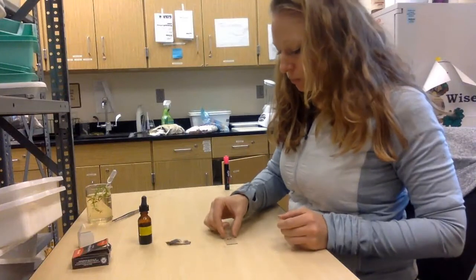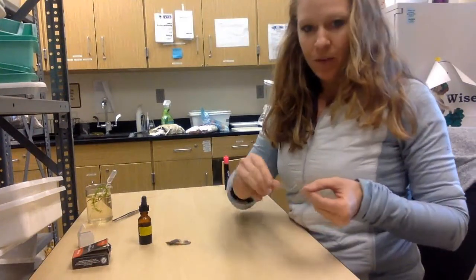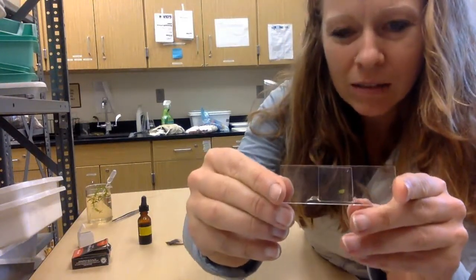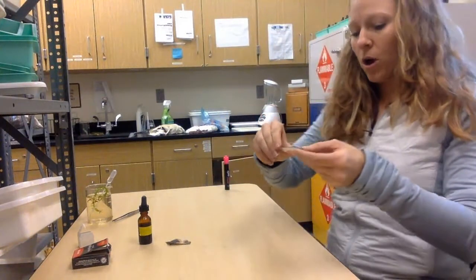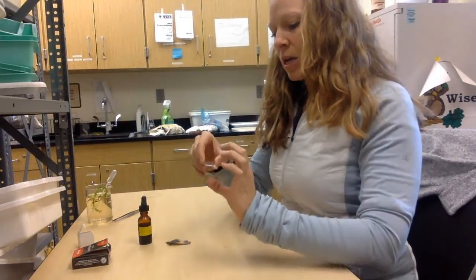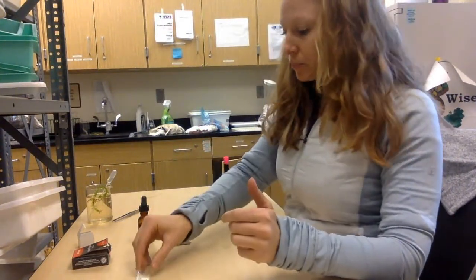It's really cool. And so then you just put a cover slip on, and then you have a little leaf inside. I don't know if you can see that. A little leaf inside with some water. Don't push on it. You don't want to push on any cover slips, unless you're trying to crush the specimen, and we're not trying to do that.